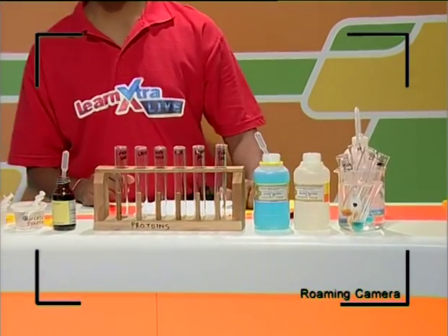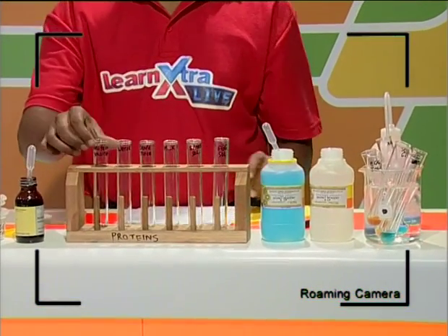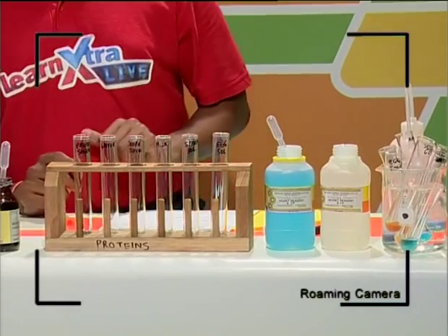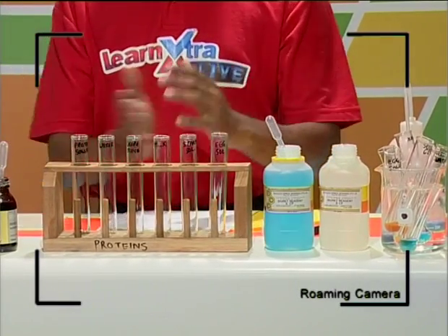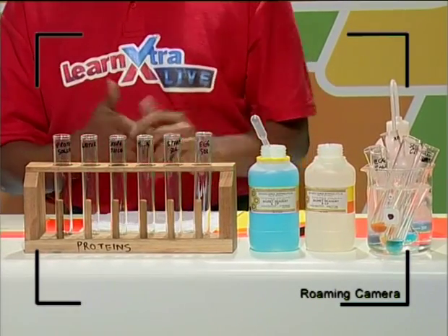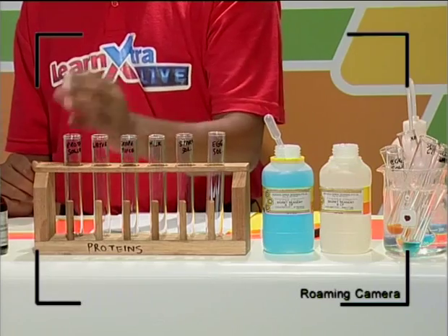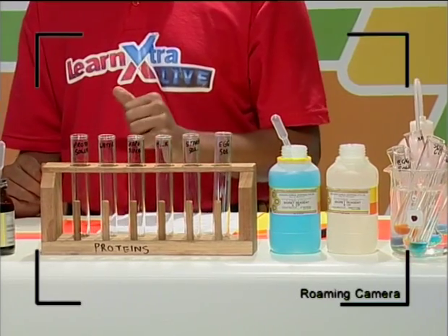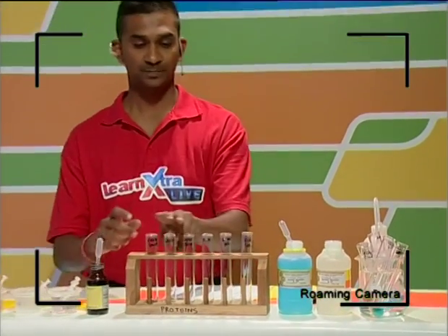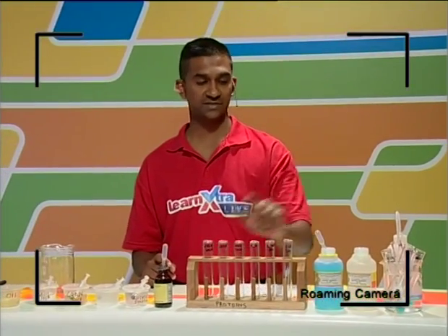Again, I've got a series of test tubes labeled for you. The first test tube is called a protein solution, and the second one a water test tube. And the reason why we do this in any experiment is to identify the positive control and the negative control. And as I mentioned, the positive control will always contain the substance we're testing for. The negative control will be water that does not have the proteins. So by looking at these two, we can compare these results to the rest.